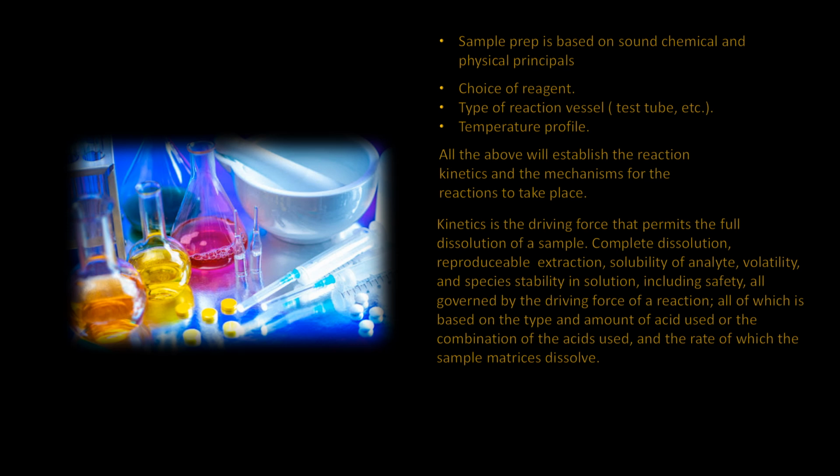There is also a safety aspect in regards to a chemical reaction. This is all based on the type, concentration, and amount of acid or acids to be used, the rate at which the sample matrices dissolve, and the method of dissolvement. That is to say, will it be a wet-dry process which utilizes fusion in the process, or some other method or procedure?